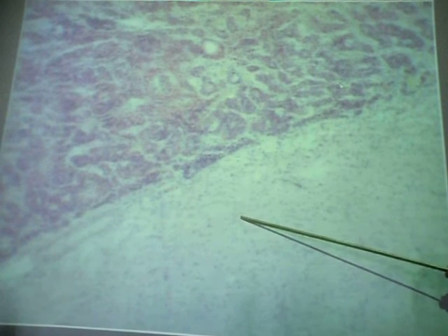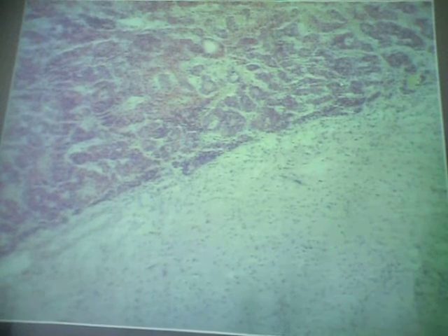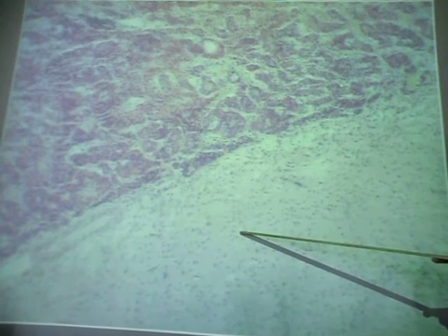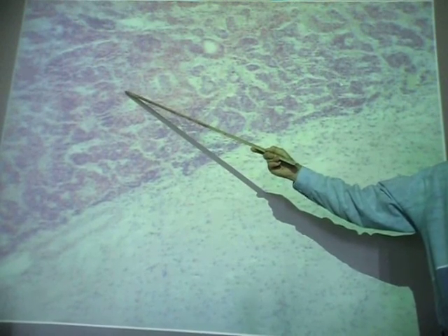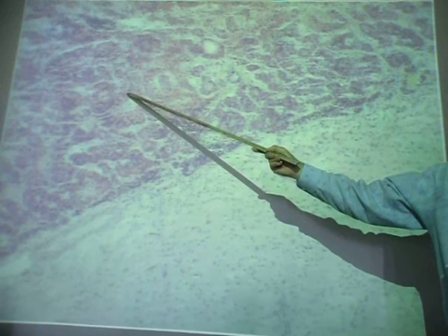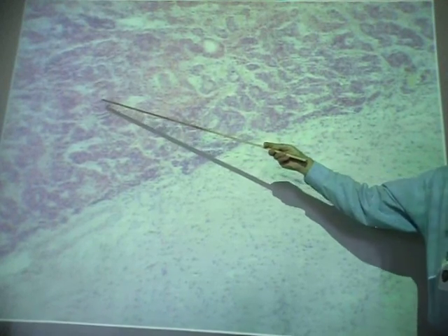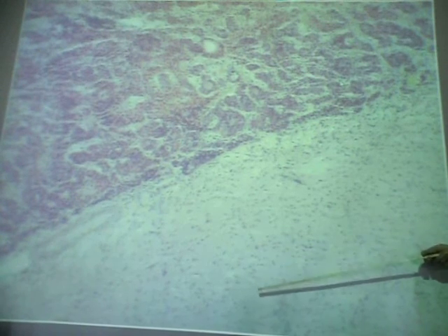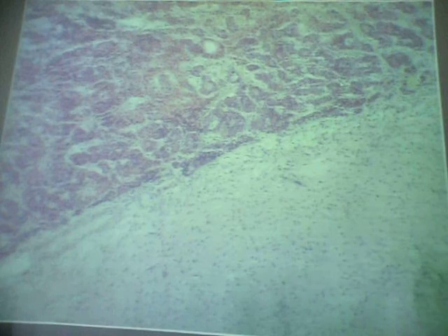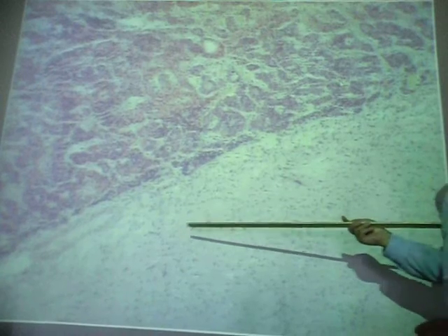This is the posterior part of the pituitary gland. Because it's mostly neural tissue, it's called the neurohypophysis, another name for it. So this is the posterior pituitary. You can see it looks distinctly different than the anterior pituitary, which is glandular, and that's called the adenohypophysis. So again, anterior pituitary, adenohypophysis, consists of glandular tissue that produces hormones. Posterior pituitary, or neurohypophysis, stores hormones that are actually produced by neurons of the hypothalamus, but released and stored here. So let's go over these.